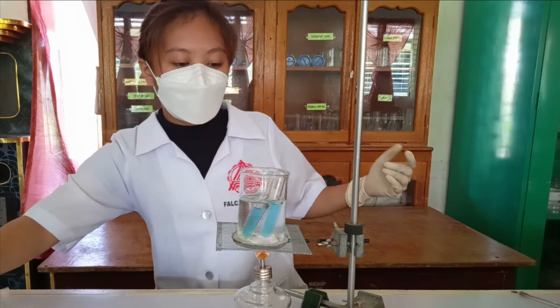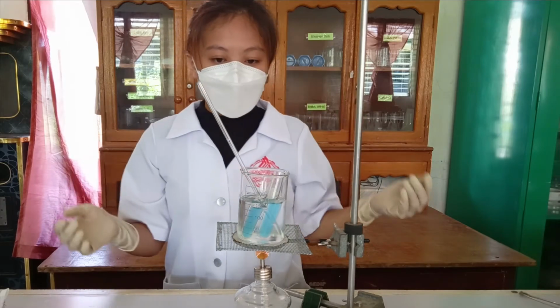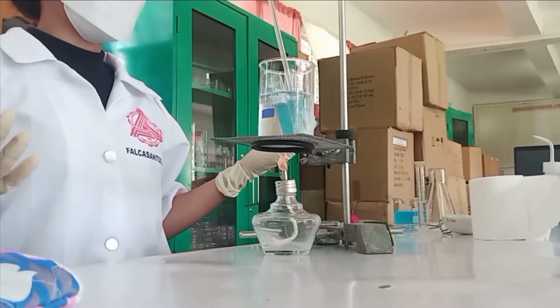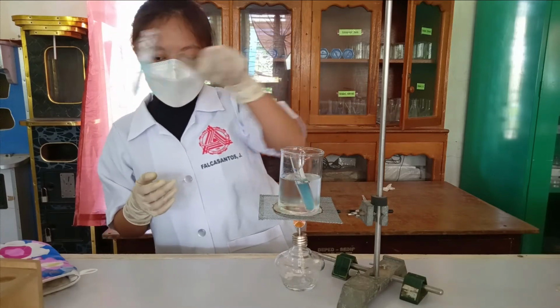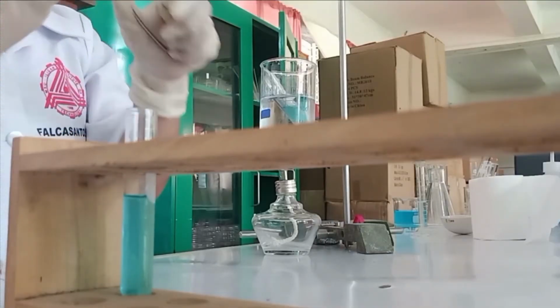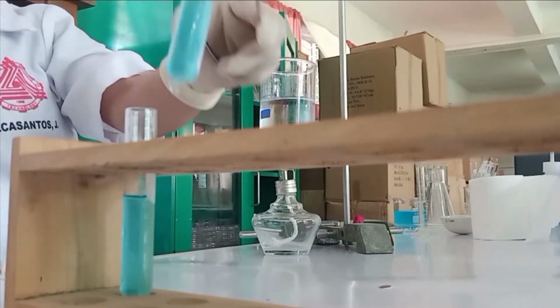Place the test tubes in a beaker that is 1/4 filled with water. Put in a stirring rod to avoid bumping and a thermometer to monitor the temperature. After the desired temperature and time, put out the flame and transfer the test tubes to a test tube rack, and leave the beaker on the wire gauze until it cools down.